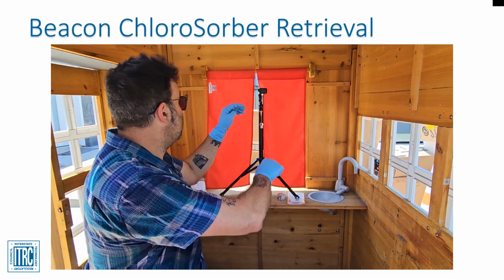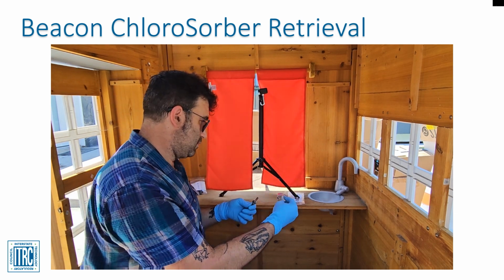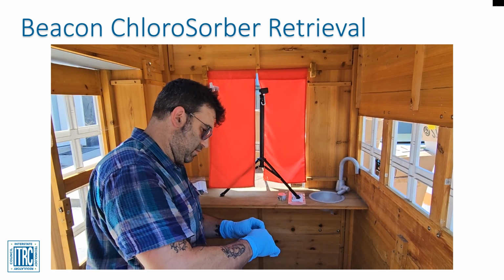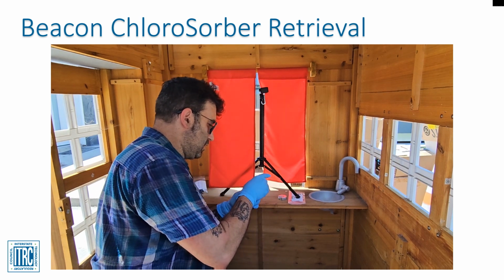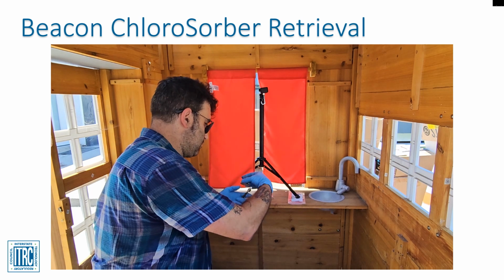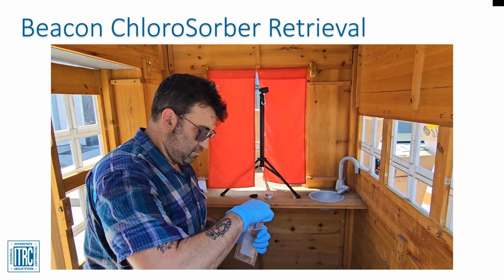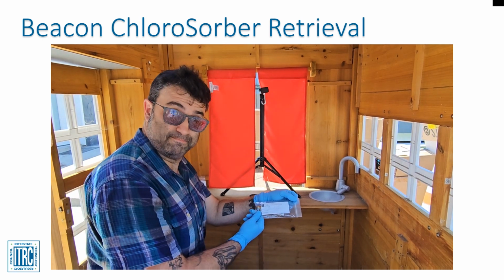Once the exposure time is complete, field personnel collect the sampler by retrieving the device, remove the plastic loop fitting, replace the diffusion cap with the storage cap, place the sampler into the plastic sampling bag, and label the sampling bag with location ID. Remember to use a ballpoint pen. The sampling date and time are then recorded on the COC, and the vial placed back in the kit, and shipped to Beacon's laboratory for analysis. The samplers do not have to be kept cold for shipment and have a hold time of 30 days.